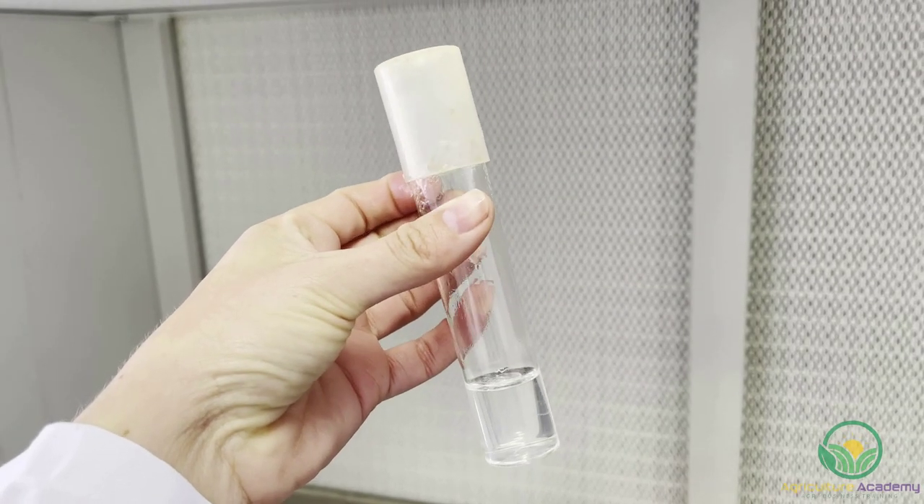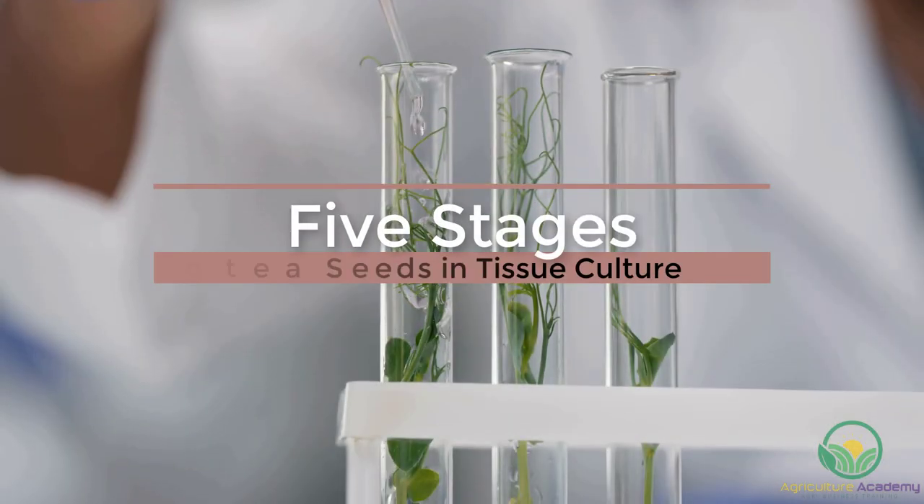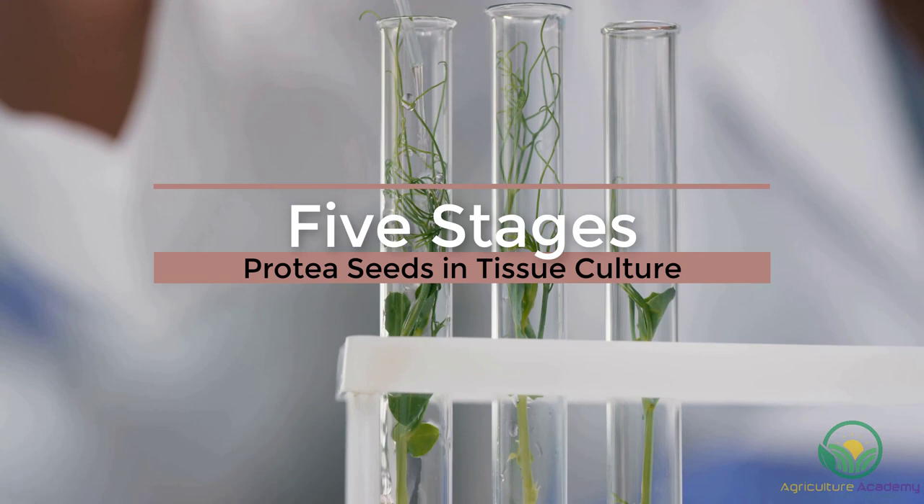Additional constituents of nutrient media include agar and distilled water. Once the medium has been prepared, it must be autoclaved and left to cool before the explants can be planted. There are five stages that need to be followed in sequence in the tissue culture process.